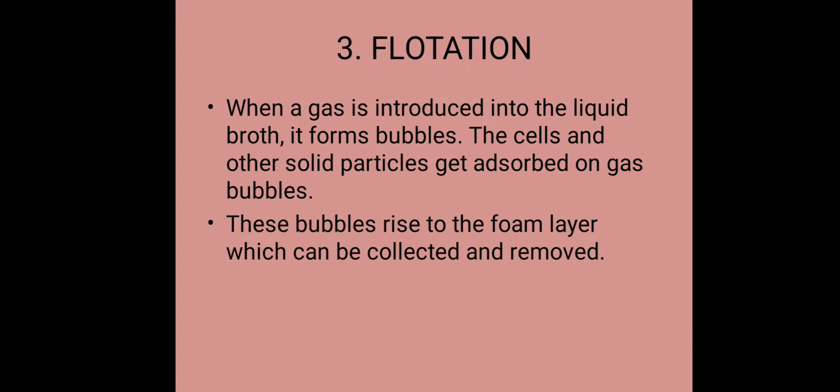The next method to remove the solids or the cells is flotation. Imagine you take a glass beaker and add water and soil into it. Let us allow the soil to settle down. Once you start mixing inside the beaker using a glass rod, the soil particles will move upward.